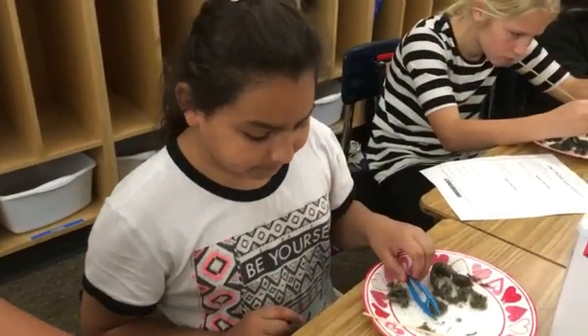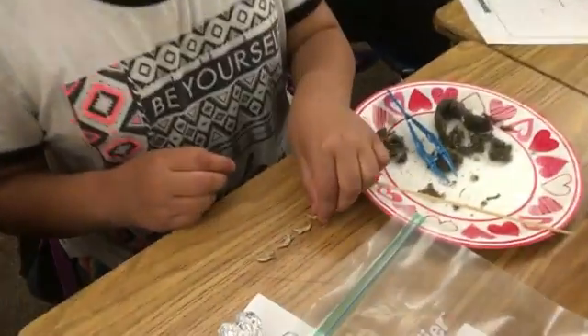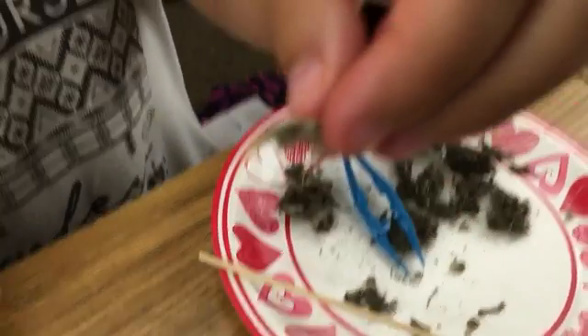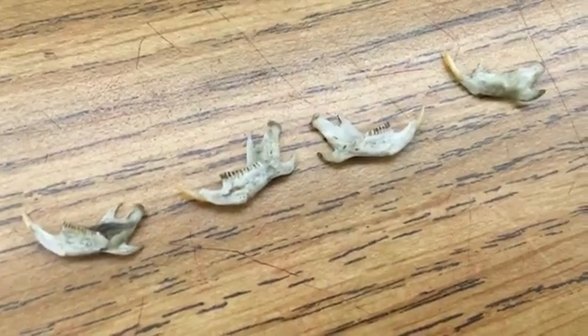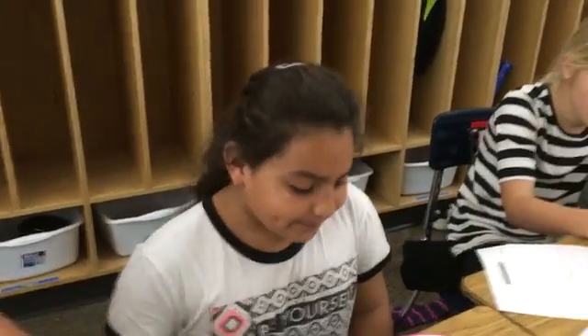If we have the teeth of a mouse — Ashley, could you show me the teeth of one of yours? Yes! Look at that — that looks pretty sharp, doesn't it? So what do you think these teeth of this mouse are adapted to eat? Yeah, mice are insectivores, aren't they.